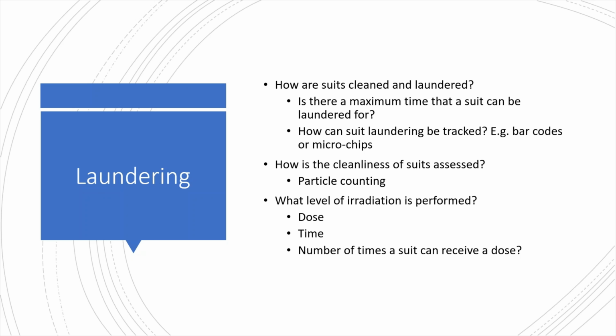With irradiation, we need to know that the dose is controlled and the time is controlled, and also the number of times that garments can be subjected to sterilisation, and how this is controlled, because all sterilisation technologies are highly aggressive to any kind of fibrous materials, and there will be a point in time when that sterilisation process will cause a sufficient level of damage.